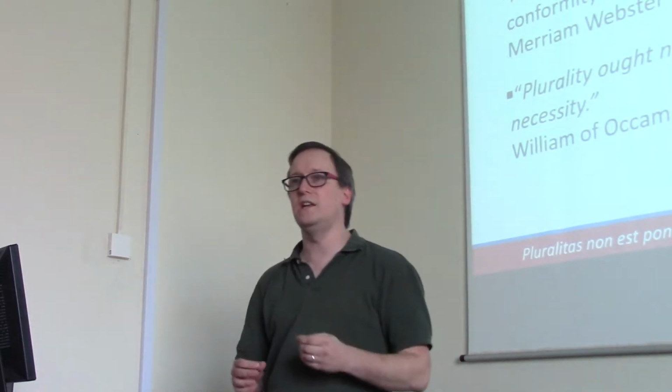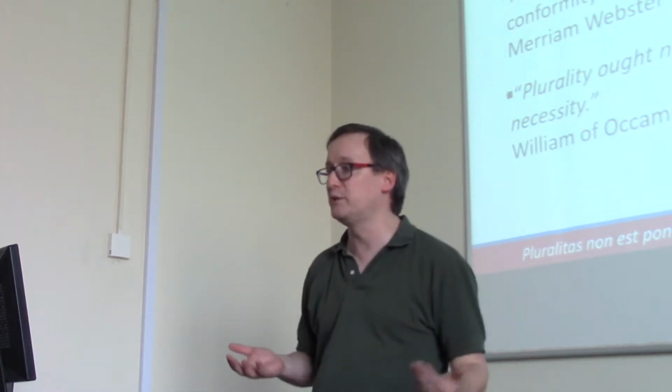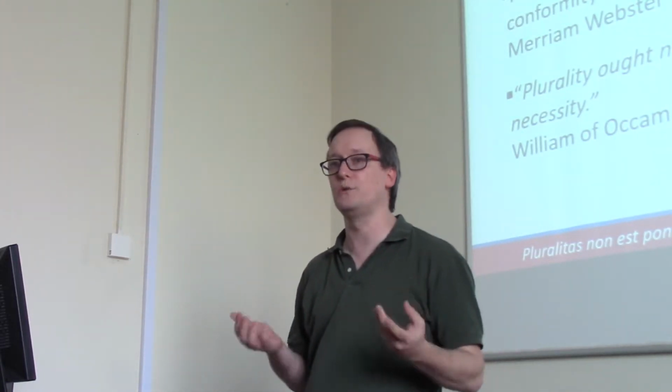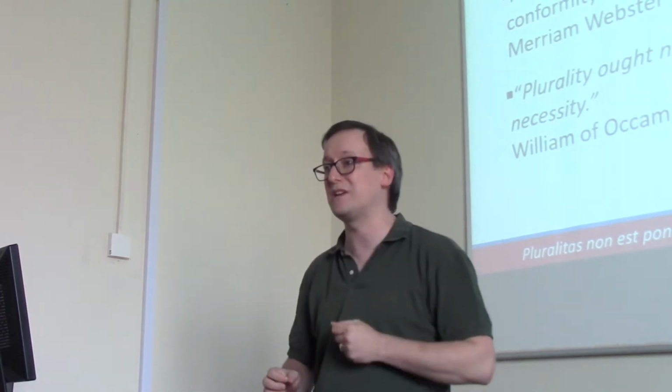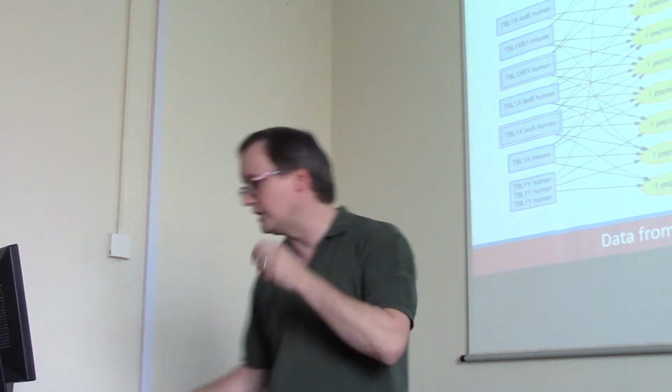So when we see multiple possible explanations for the peptides we see, we should always choose the one that invokes the fewest proteins to explain the peptide evidence we have. What does that look like?